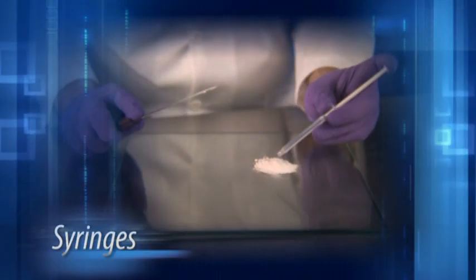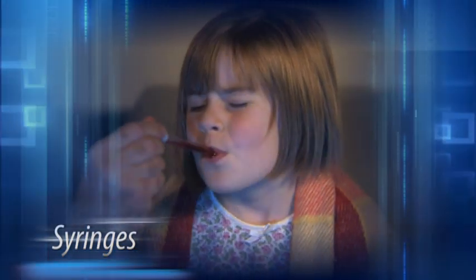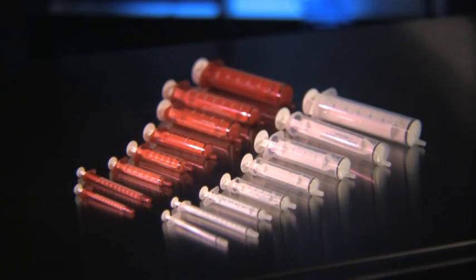You're probably familiar with syringes, the medical devices used in injection, withdrawal, or irrigation of fluids in and outside the body. We use them in non-sterile compounding in both mixing and administering medicine. Syringes are usually plastic and range in size from 0.5 or 1/2 milliliter to 60 milliliters or more.